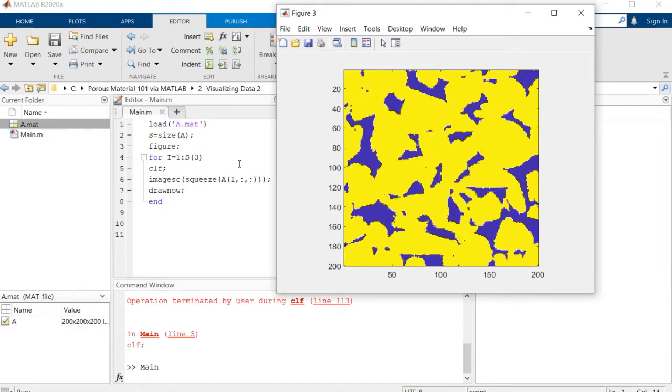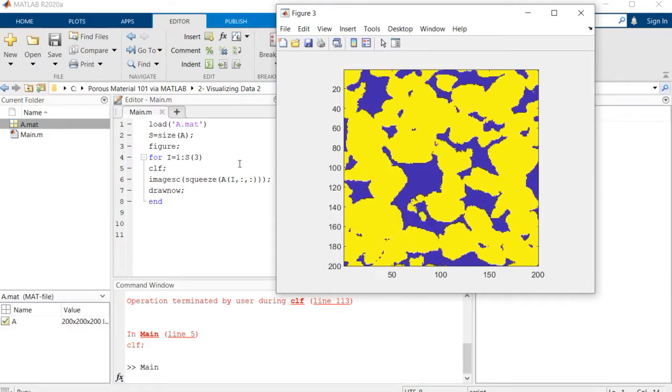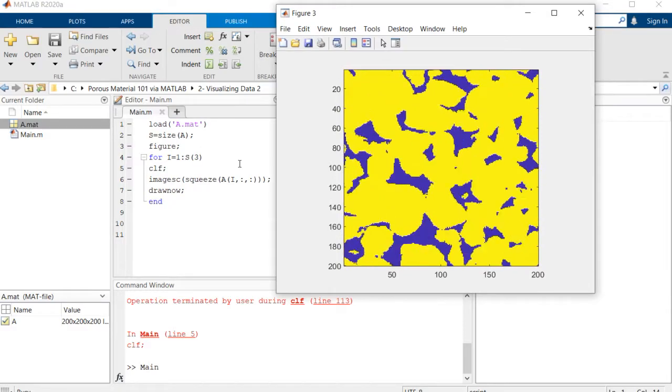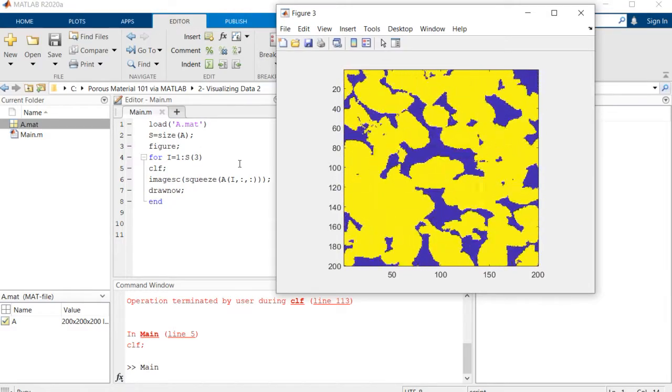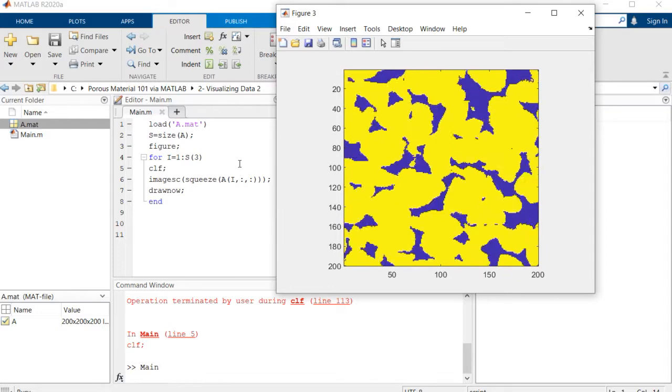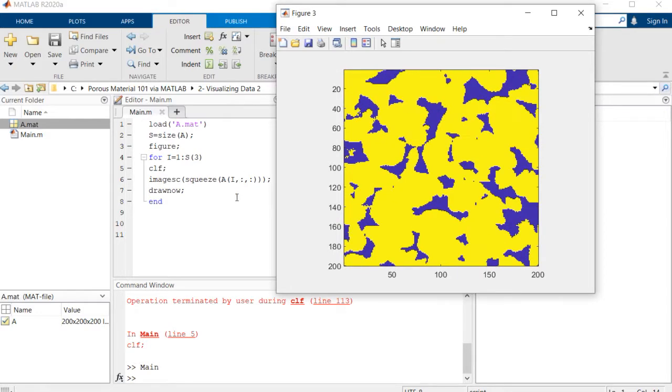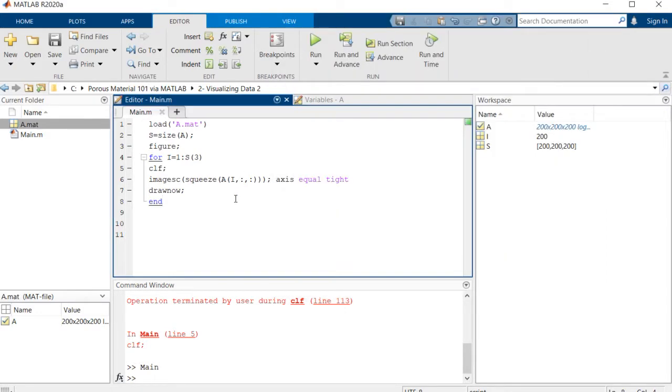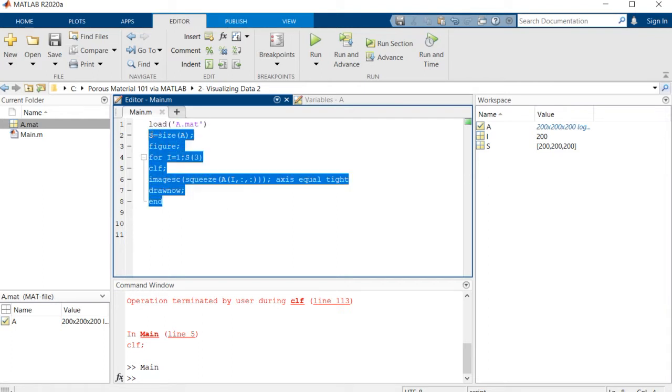But this is not exactly what we wanted to do. We wanted to visualize it in actual three dimensions, so I'm going to comment out this section.